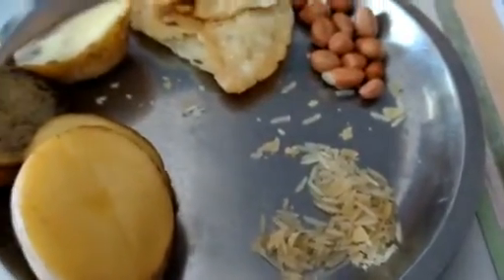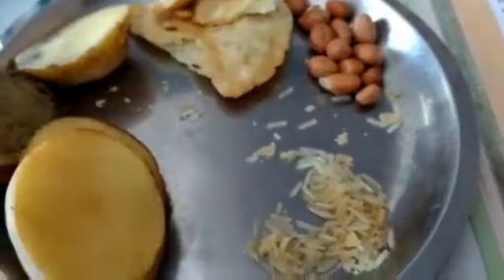Now let's go for the protein test. For that I need to crush a few of the rice particles.